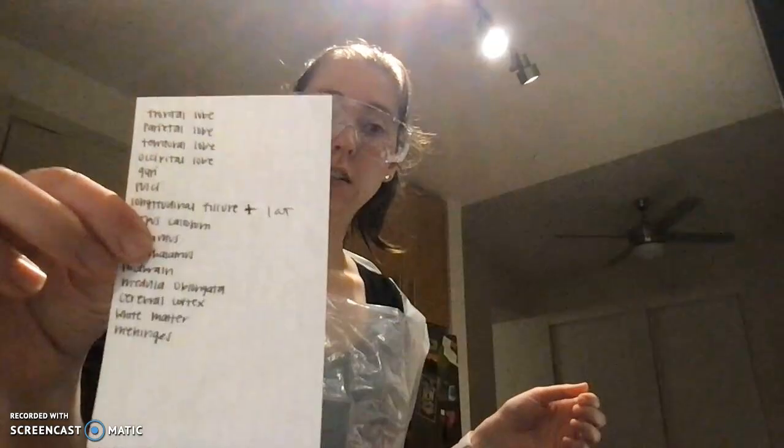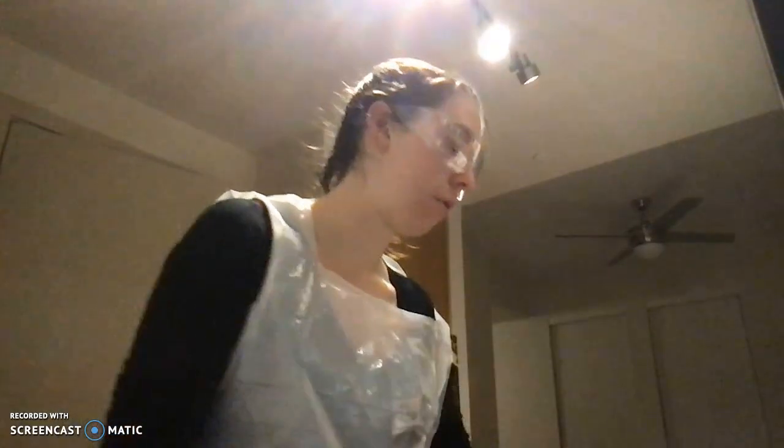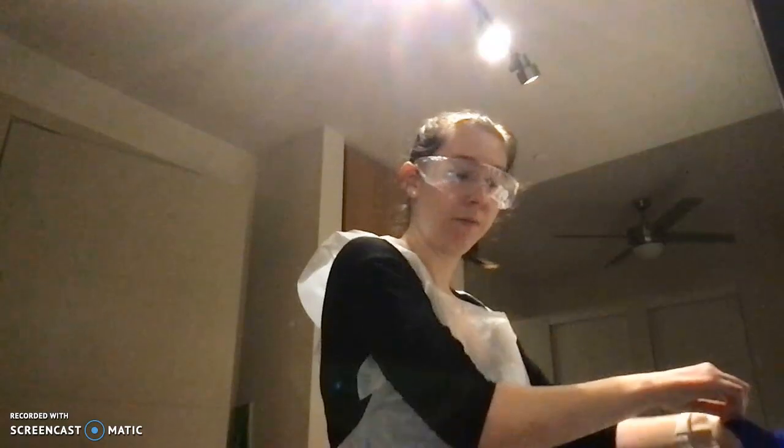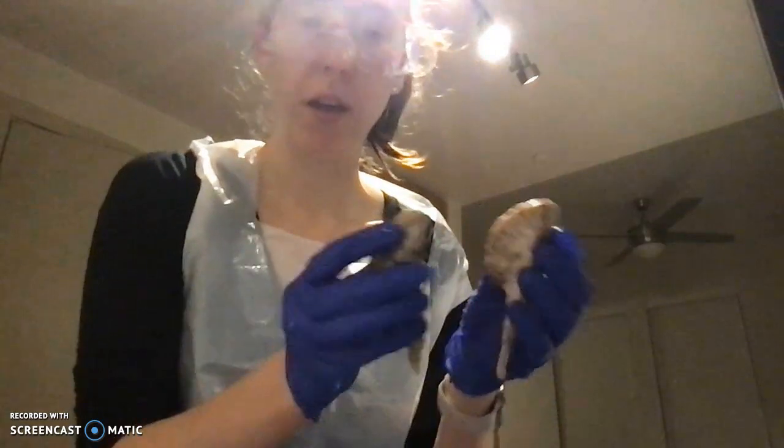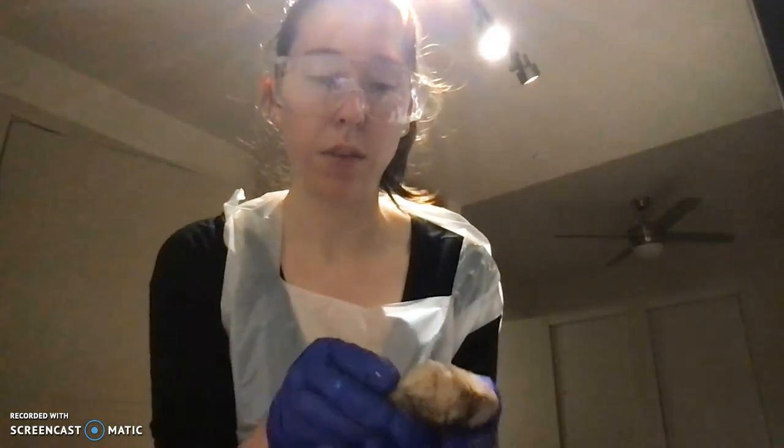Here is a little note to keep me on track with all of the terms that I need to go over. So I'm just going to put gloves on real quick here. Okay, and so here is my brain. I cut it in two pieces so we can see everything, but this is what it would look like put together.